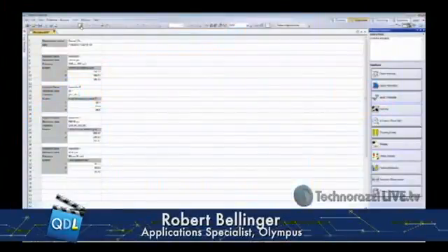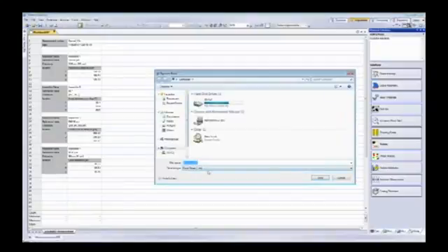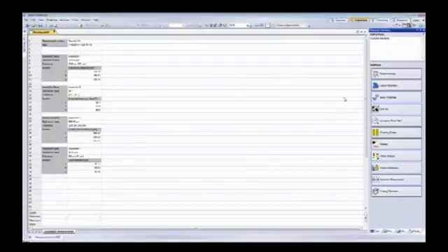One thing to mention, on all these solution modules, when you're finished, you'll get a workbook feature showing all of the measurements and your tolerances. These can be sent right out to Excel or your reports or PowerPoint. It's a workbook, and we just hit an Excel button here, and it lets us save out as an Excel document. Or we can go right to our reporting tab and generate a Word document with this embedded into it. It can also be sent into a PowerPoint document.